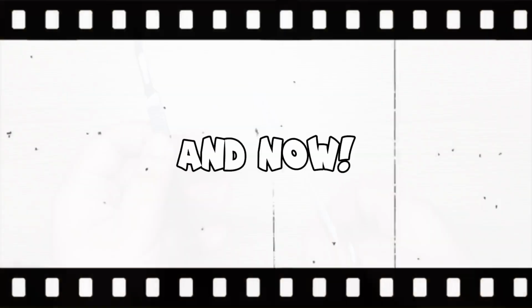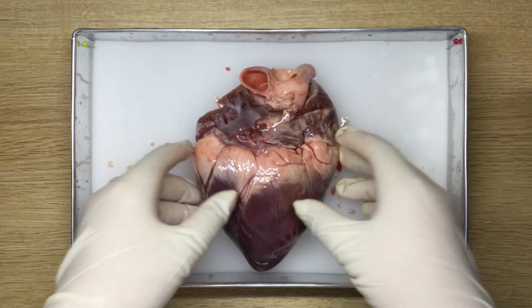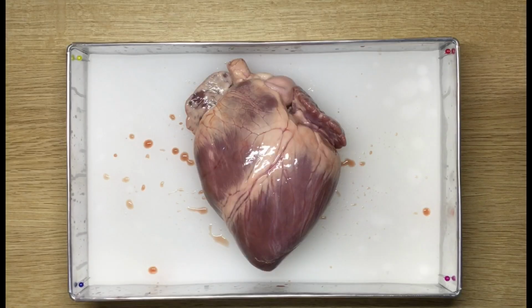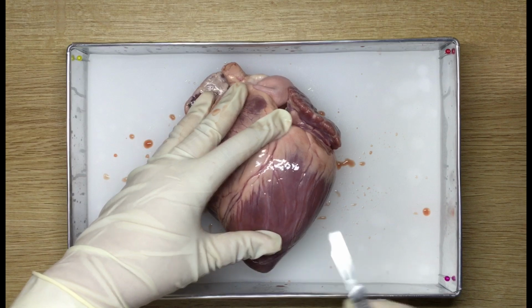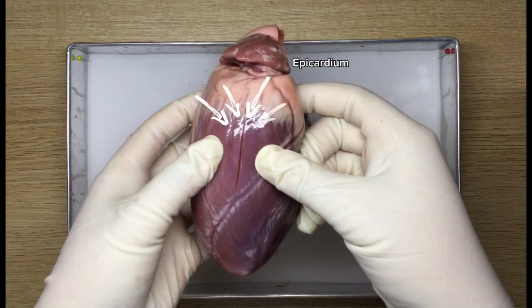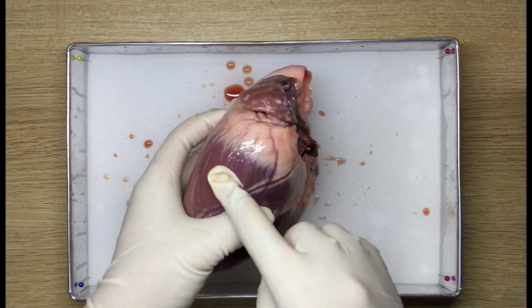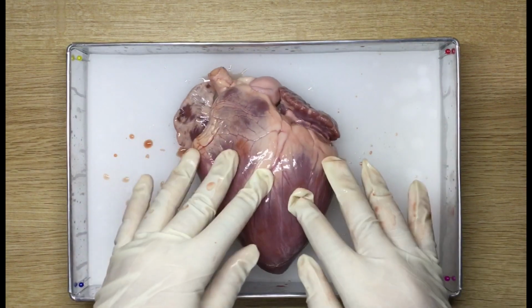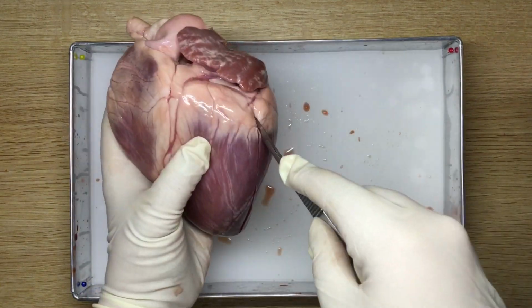And now, we're ready to dissect a pig's heart. This is the anterior of the heart, and this is the posterior. In the exterior of the heart, there are 3 layers of tissue that form the heart wall. And this is the visceral pericardium, also called the epicardium, allowing smooth mechanical function of the beating heart. And we will be able to locate the middle layer, which is the myocardium. Now, let's open and explore the inside of the heart.